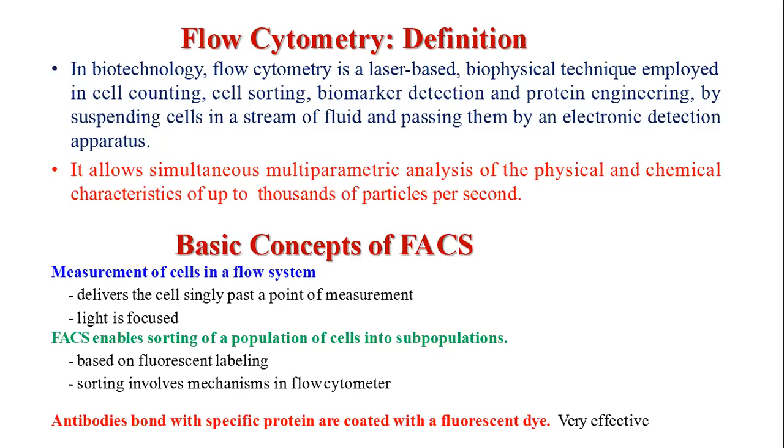So it's not a manual counting, it's an automatic electronic counting. Or through automation, we can count it within a few seconds. And also we can sort it. But what is the percentage of, say, group A type of cell present there?